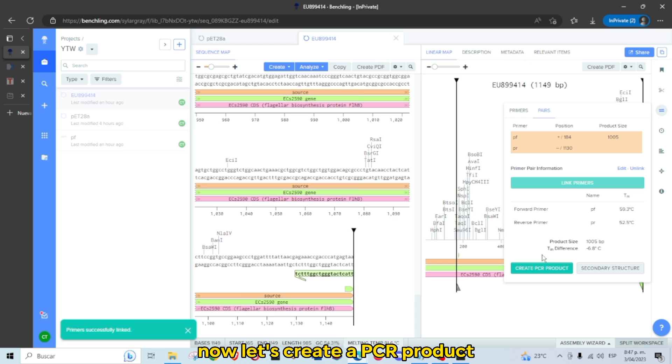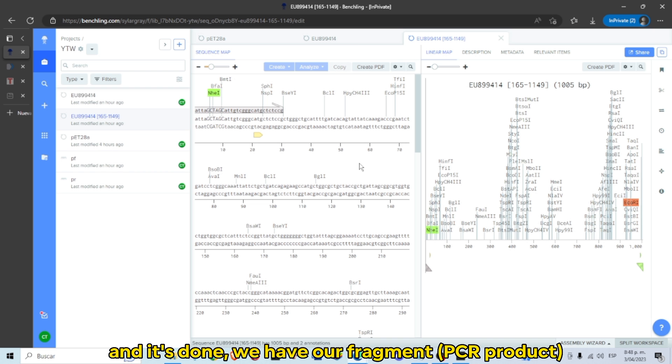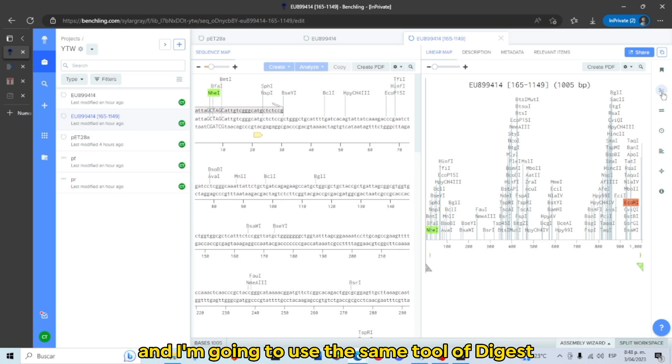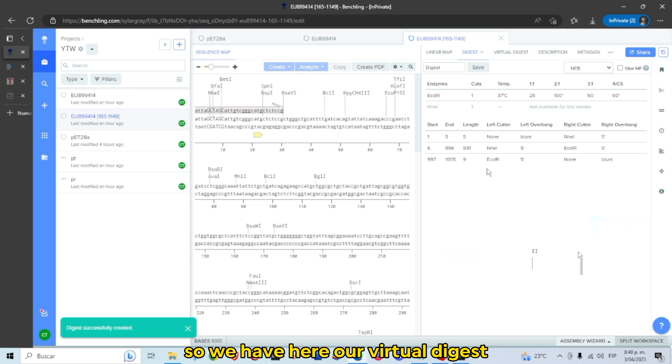Now let's create a PCR product. It's done — we have our fragment or PCR product. Using the same digest tool, make sure you have selected both restriction enzymes and run a digest. Here we have our virtual digest.